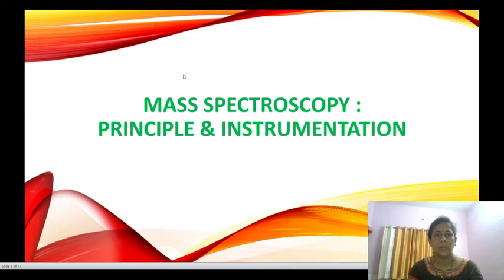Hello everyone. Today I am going to discuss mass spectroscopy. In this topic, we are going to discuss the principle and instrumentation presented by me.